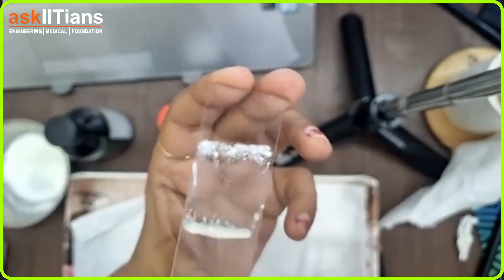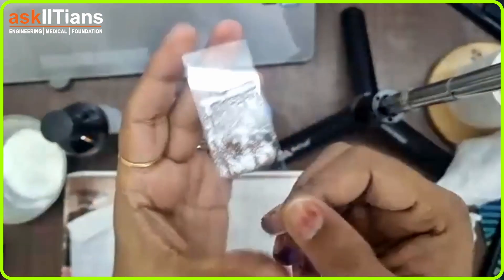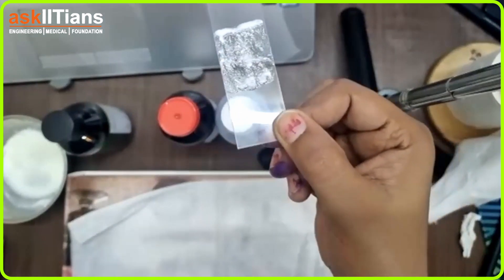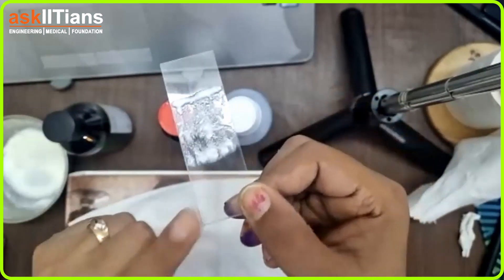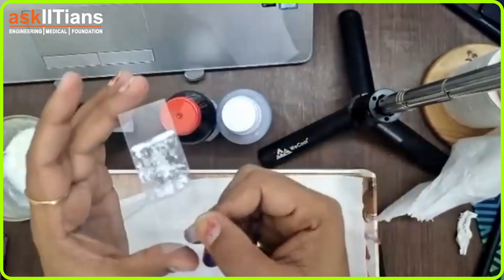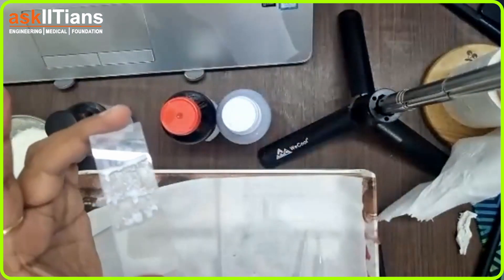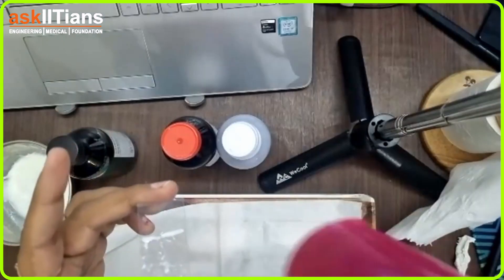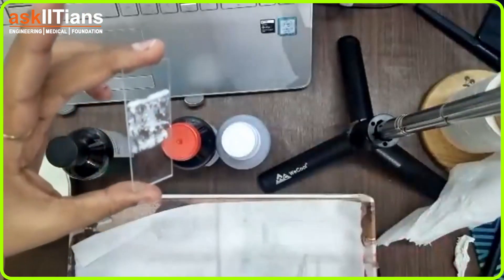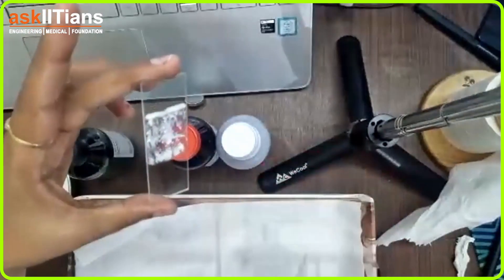Now you need to dry this bacteria — actually, 'dry' is not the proper word; we use the word 'fixing.' We are going to fix the bacteria. Fixing can be done with heat, but I'll prefer a dryer because heating can damage and kill the bacteria. I'm using a blow dryer, keeping it at a distance so the bacteria is not damaged.